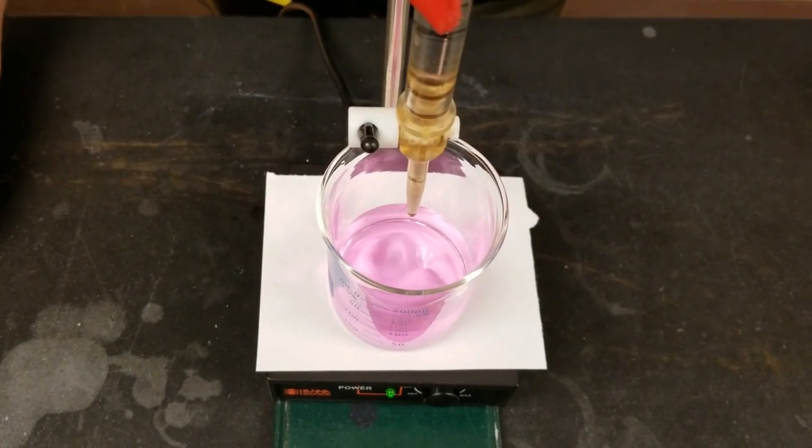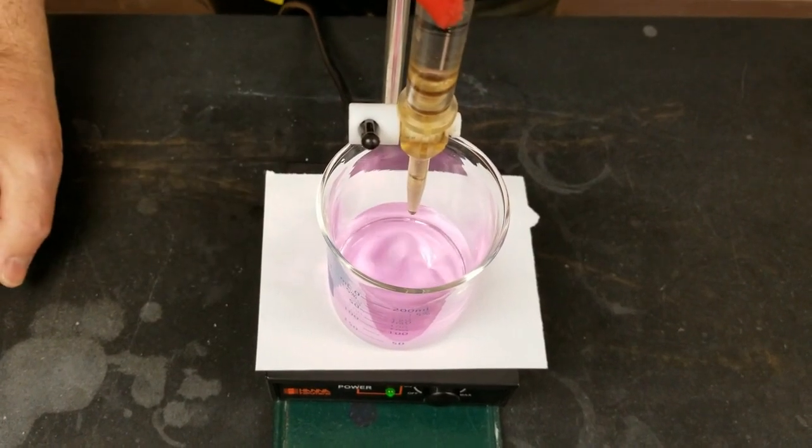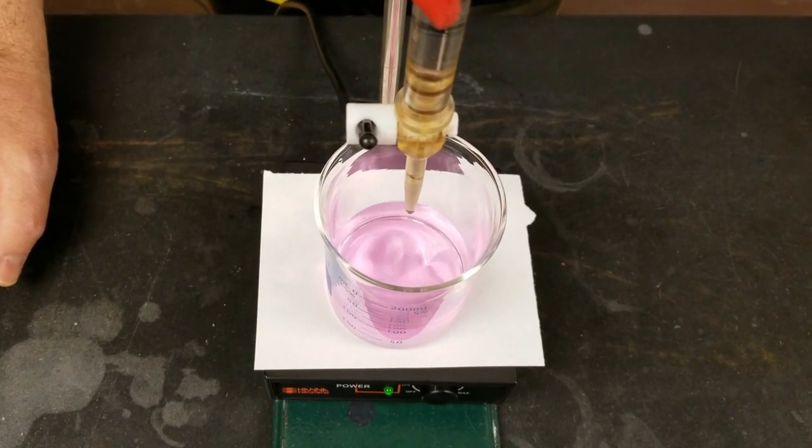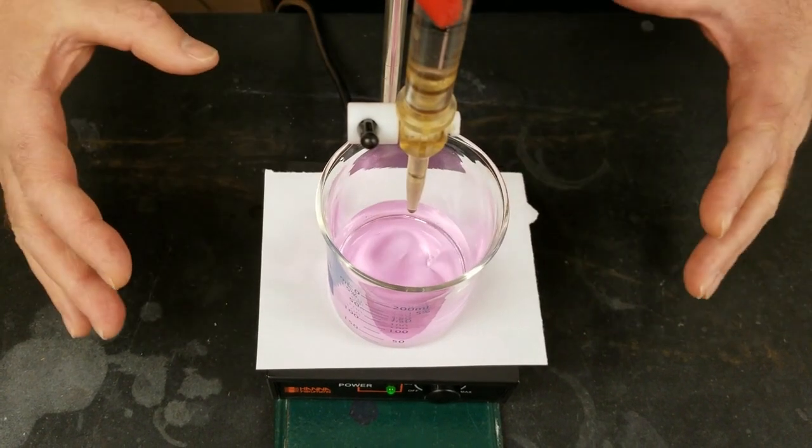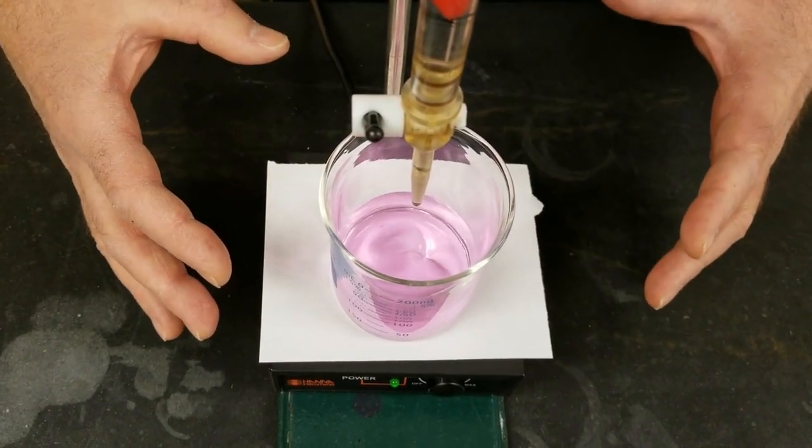And you want the phenolphthalein color, the indicator color, to last for at least 30 seconds. If it goes away in that 30 second window, you're not quite at the end point. The end point is when the indicator changes color. The indicator, the PPN, is a weaker acid than the KHP.